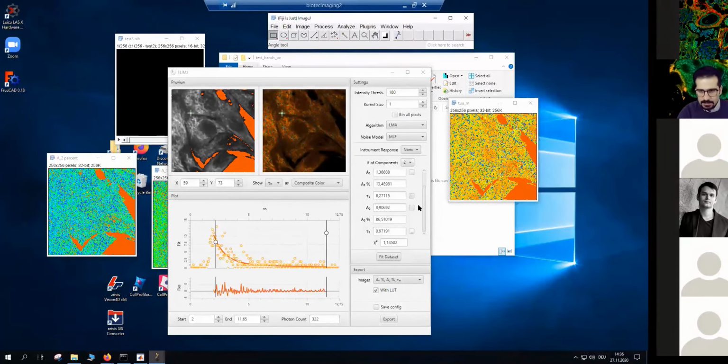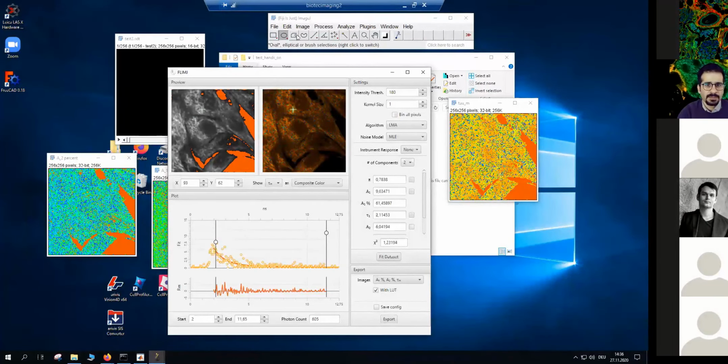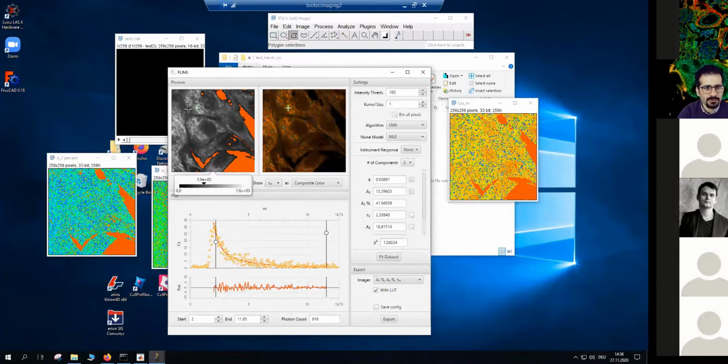No, I don't see any option for choosing the region of interest inside. And also if I activate that in Fiji, it's not really responding here. But I'm sure that the Fiji developers know how to activate that. It should be quite easy that when the user chooses something here, it would be activated in this user interface for FLIMJ as well, or not.